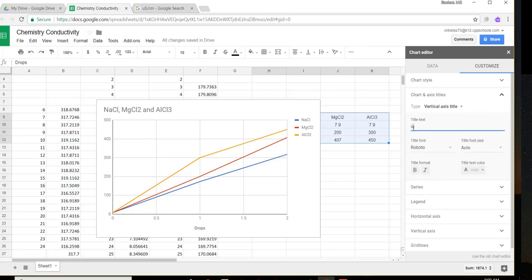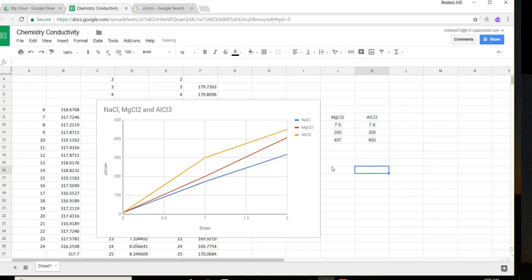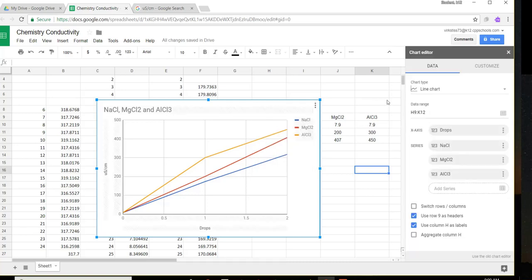We're just going to use a lowercase u, capital S slash centimeters, and that looks pretty good. So we got that. We got that here. We got the drops here. We're pretty good. Now we need a line of best fit. So we can go back into edit chart.